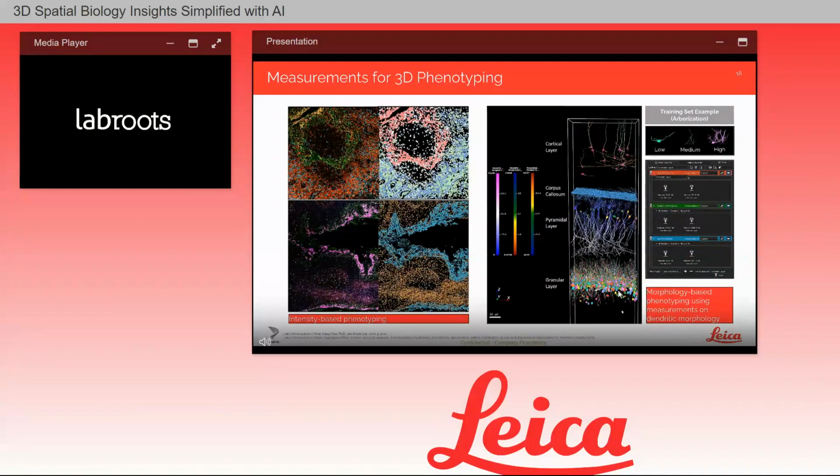We took neurons in the granular layer, and based on the characteristics of the dendrites, for example, dendritic branching numbers, dendritic length, and tortuosity, we trained the phenotyper for 3 different levels of arborization, which is the extent of the branches of dendrites you see in each neuron: low, medium, and high. In this particular example, we wanted to understand the limit of the phenotyper, so we actually used only 2 neurons per class. And because the measurements that we chose were quite robust for distinguishing these 3 neuronal cell types, with just 2 neurons per class, we were able to get very robust classification in this example.